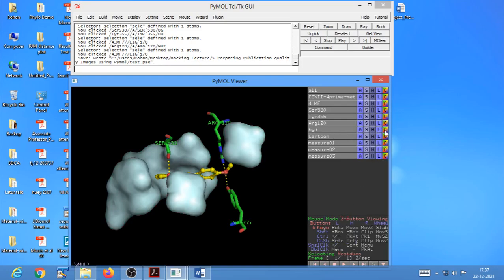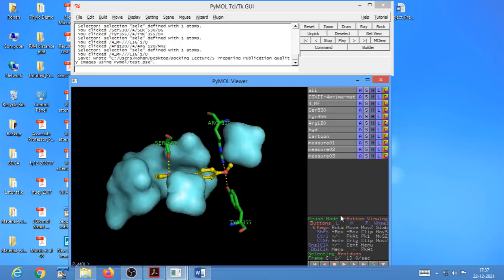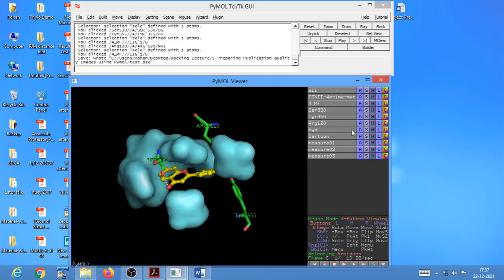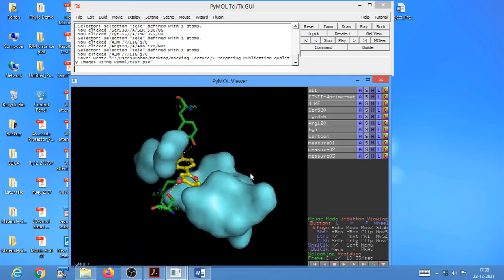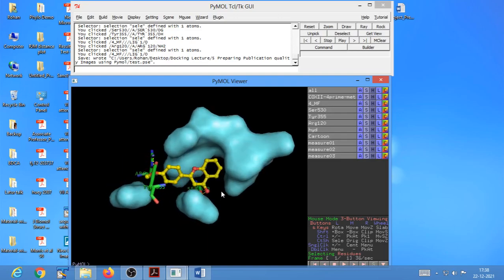Okay, and coloring is not really my strong point. This appears to be good. Okay, what we have used for coloring is this aquamarine or green cyan, I suppose. Green cyan, I suppose it was green cyan, right? Okay, so final. Okay, now let us see what we can do about the resolution of this surface, right?